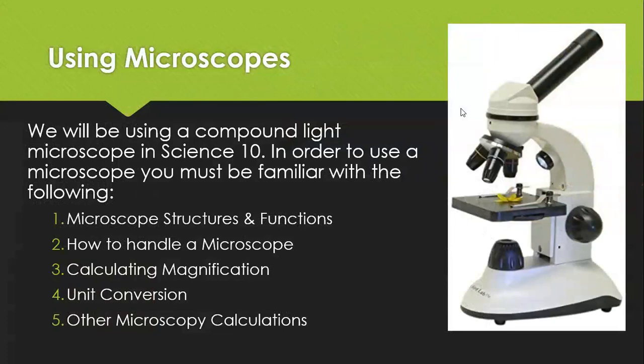So in order to use the microscope in the lab, you're going to have to be familiar with a few things. You're going to have to be familiar with the structures and functions of the parts of the microscope, how to handle a microscope, calculating magnification, some unit conversion. And then there's some other microscopy calculations that are involved in dealing with things like field of view, etc.